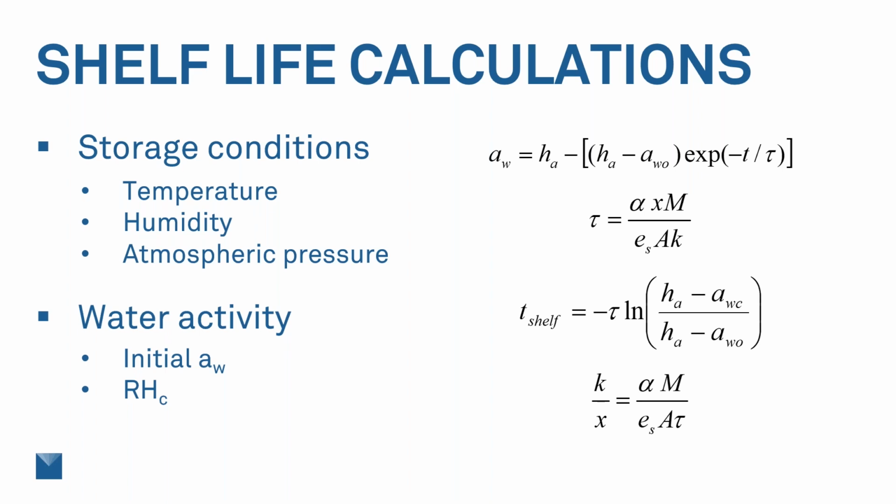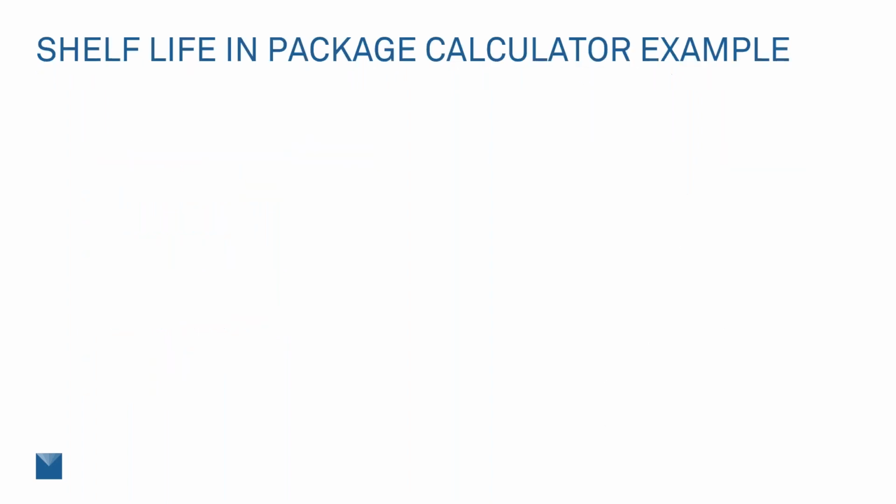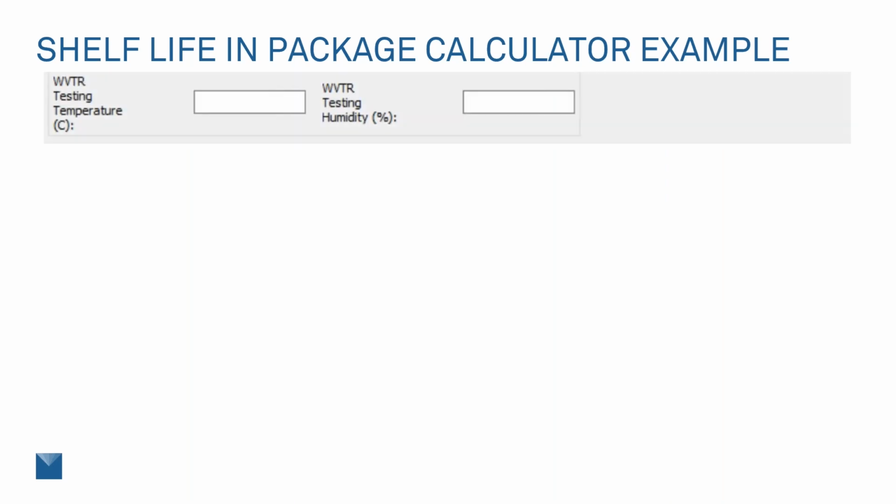So there are several equations that go into these shelf life calculations. We're not going to go into them in any great detail today, but if you have any questions about the calculations, please feel free to reach out to us. So we're going to be looking today at a shelf life calculator that we use here at Meter Group that is in our moisture analysis toolkit. So these are screenshots directly from that software.